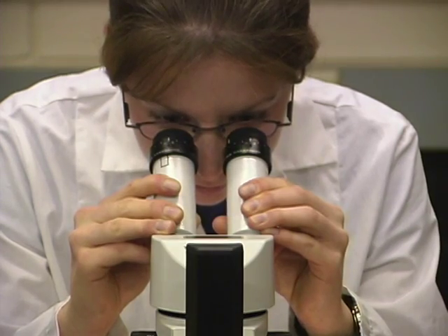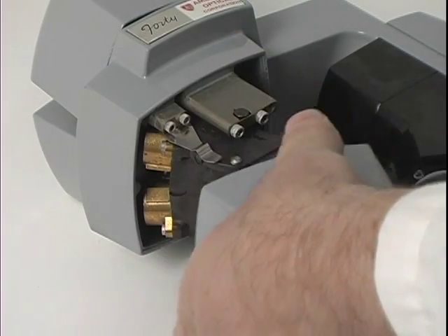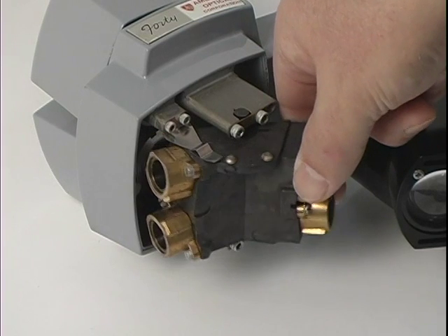Stereo microscopes are all binocular because they must have two ocular as well as two objective lenses to create three-dimensional or stereoscopic images.